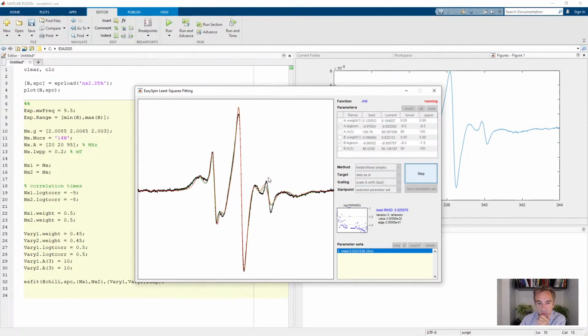Are we able to get a better fit for this spectrum here? It doesn't look like it's helping us a lot. So just feeding those 2 parameters doesn't work because some of the other parameters are still off. So as you can see, this is an iterative procedure that really requires you to think about your spectrum as well.